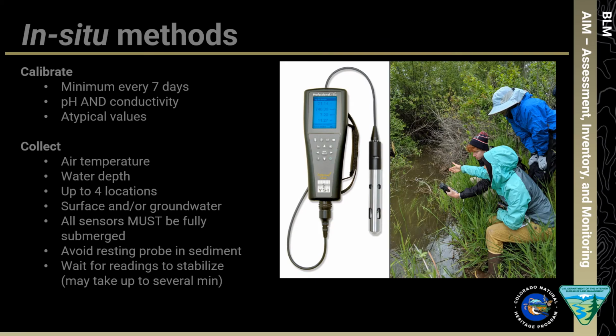Before collecting any water quality measurements, it is important to ensure that the water quality probe has been successfully calibrated following manufacturer recommendations or within the last 7 days, whichever comes first. Crews should maintain a calibration log with their sensor to document when and how the water quality probe was calibrated. Additionally, if the YSI values are atypical, it is essential that crews recalibrate their machine. If there is explainable reasoning for the unexpected value, please include comments.